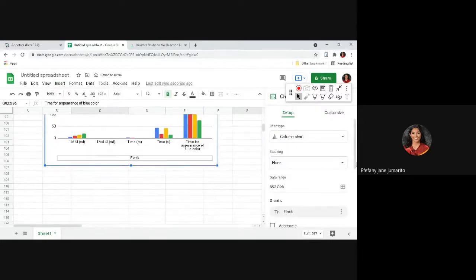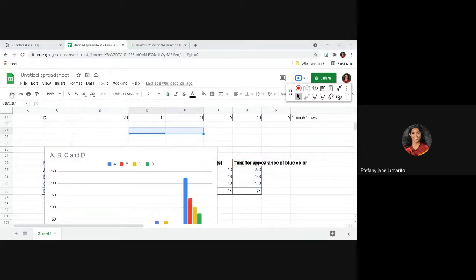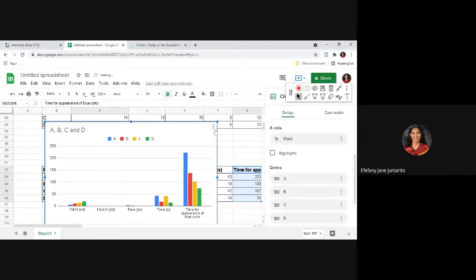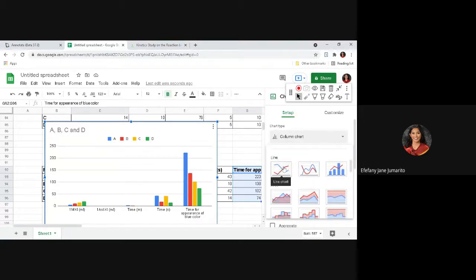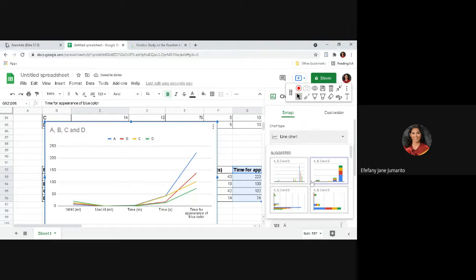Okay, but the chart is, let's change the chart setup. Okay. Wait. Balik sa ta. Okay. Insert chart. Diretso lagi ni. Okay. Then we have, all right, diri na to a chart type. Line. We will choose line chart. Okay. Scatter. Why scatter?